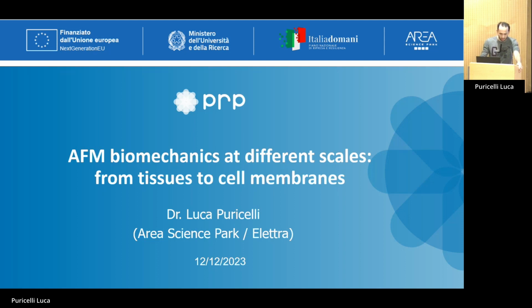So, the title of the presentation more or less says it all. I'm going to talk about why it's important to measure mechanical properties for biological samples. I will show you examples of this at different scales, going from tissue to cell membranes, and I will show you why atomic force microscopy offers a great potential in this field.